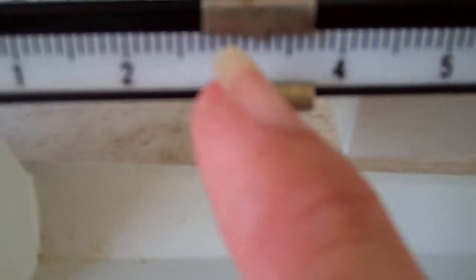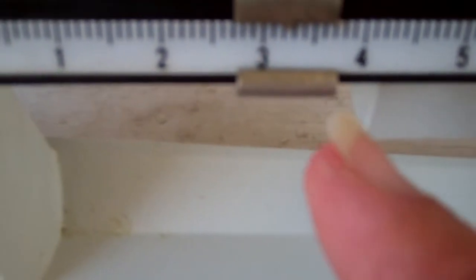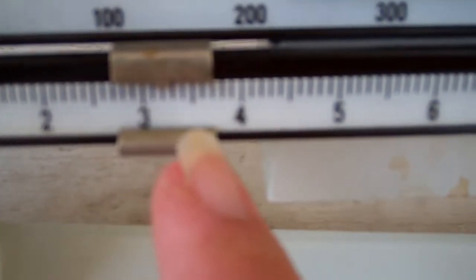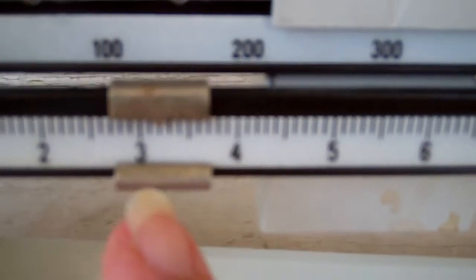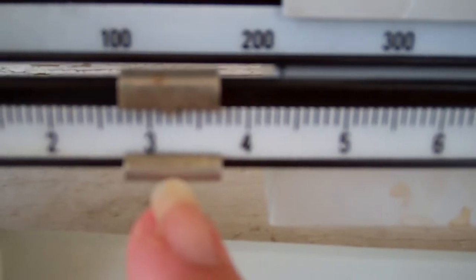This front one, if you notice the pointer, which is right here, it's not sitting directly on the three, it's past that. So the way you would read this is that it's three, three point two. It's two little lines past the two. So this is three point two grams.